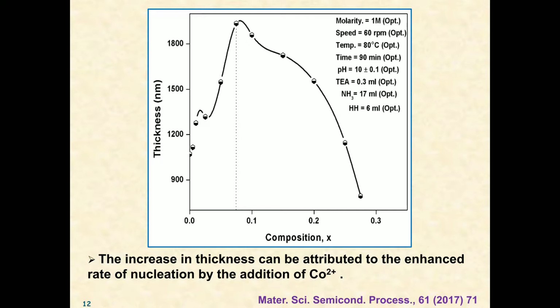The increase in thickness can be attributed to the enhanced rate of nucleation by the addition of Co2+ up to x equal to 0.075, and a considerable scattering may cause the observed decrease in layer thickness at higher x values, as shown in the graph.